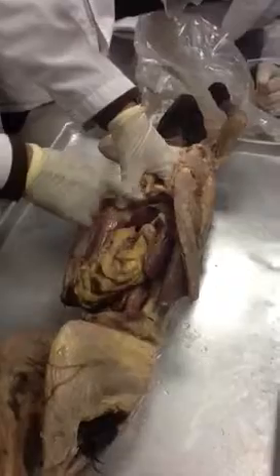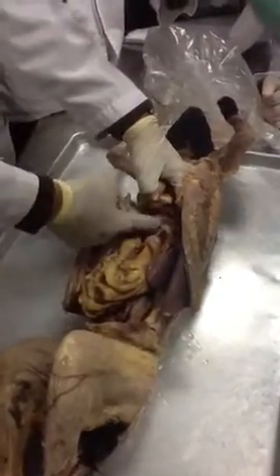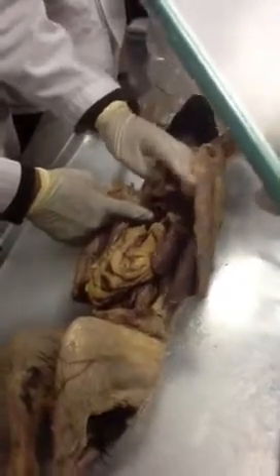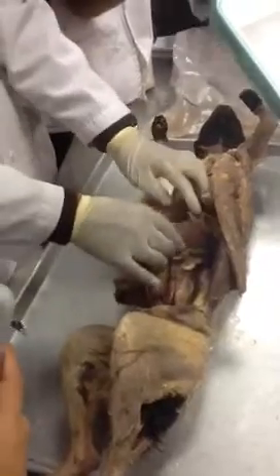The liver is the right one. Yes, you're touching the liver now. So this is the left one, the left upper part. This is the left of the cat, right? Yeah, no doubt. So now let's talk about the intestine.